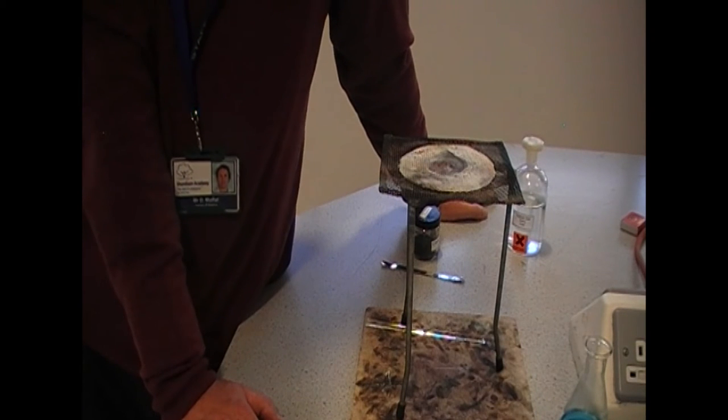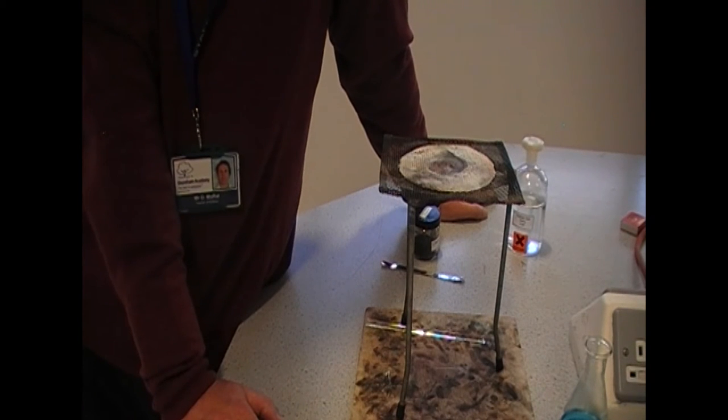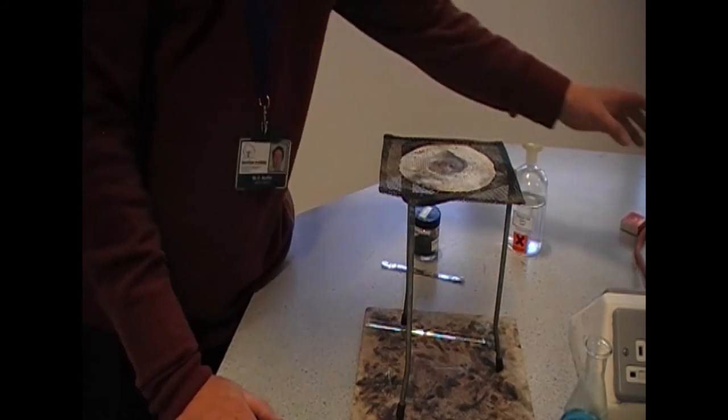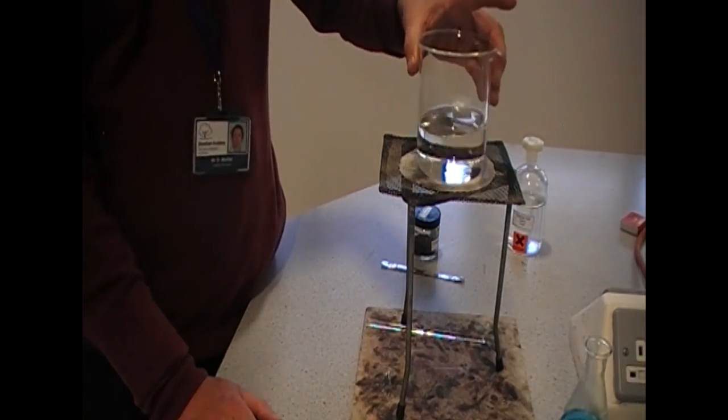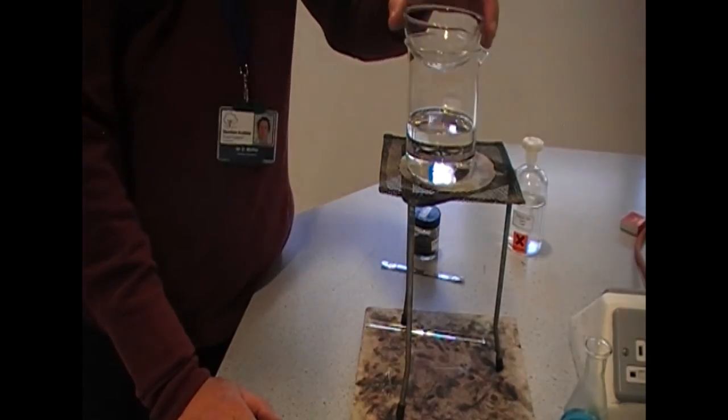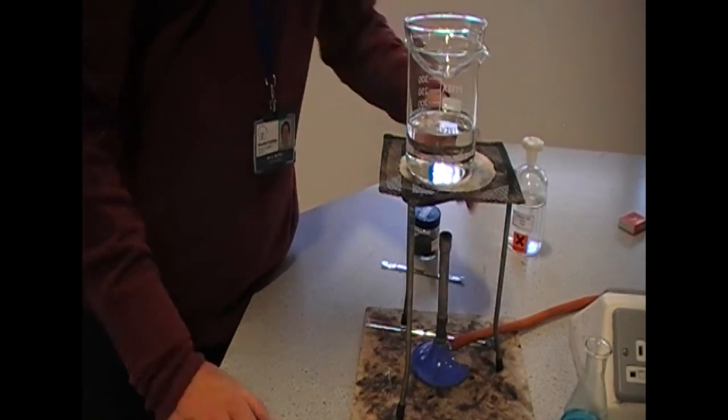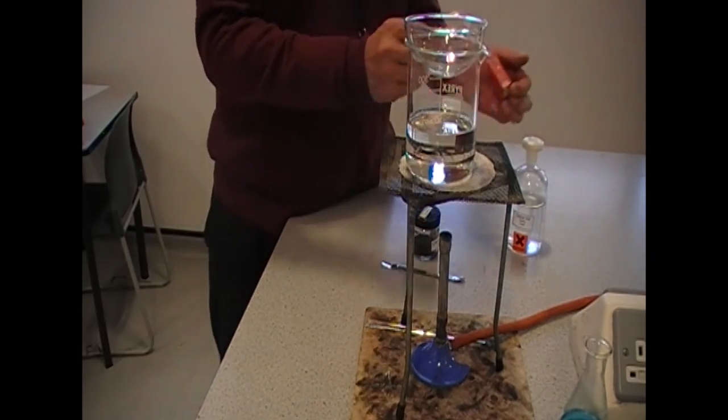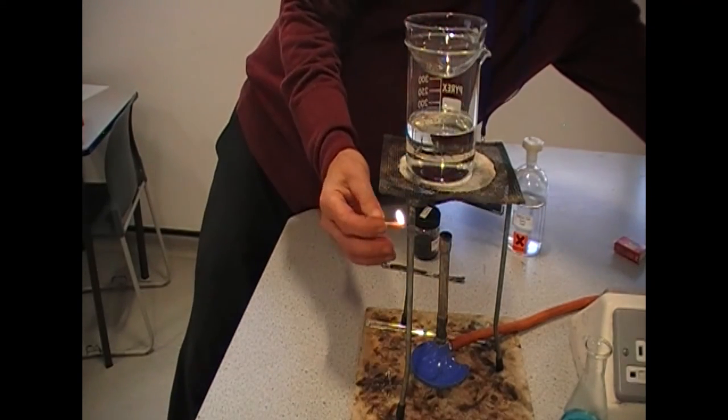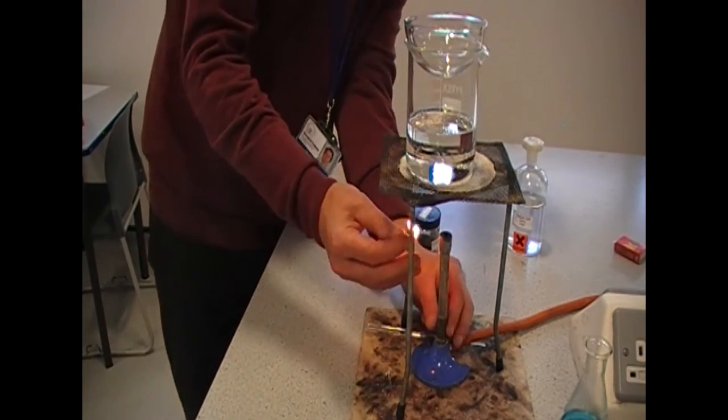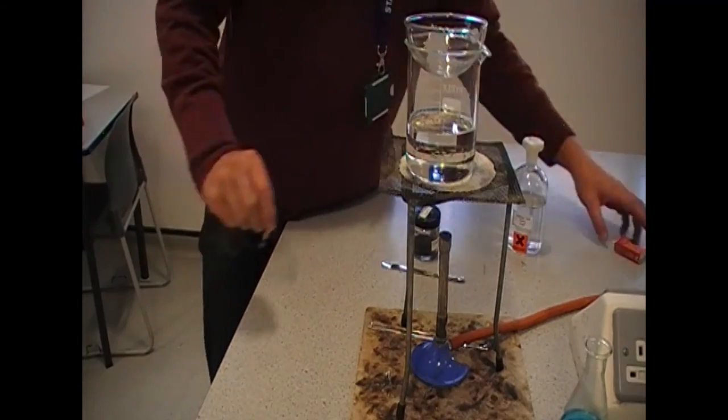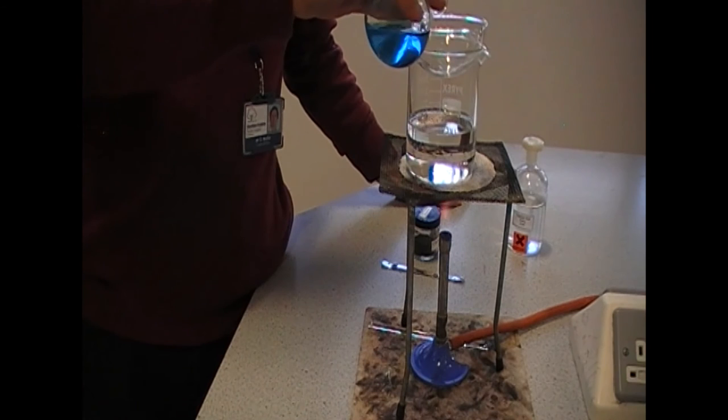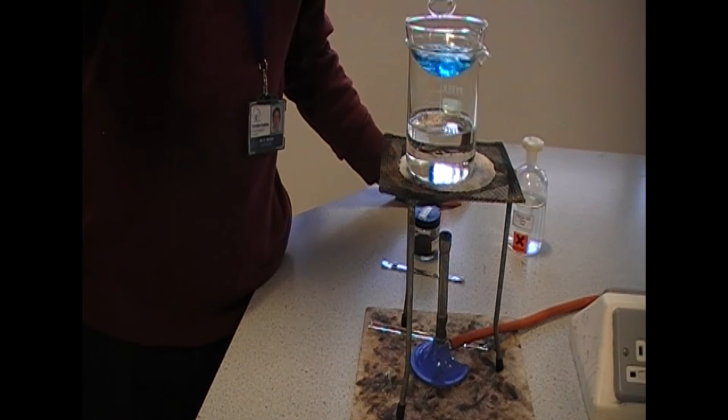When the filtration is complete, pour the contents of the conical flask into the evaporating basin and evaporate this gently using a water bath. Here's our water bath. Here's our evaporating basin. Bunsen burner.